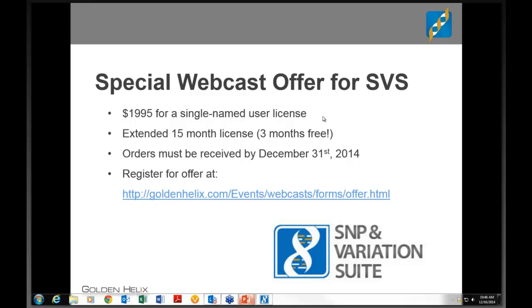Moving down, let's see, can exome data be used instead of SNP chip data for human near Mendelian disorders? That's an interesting question. It's a case that I haven't really tested. The question becomes, with exome data, typically a matter of the frequency of the SNPs and what kind of statistical power you get from them. Quite often, the SNPs on the exome chips tend to be very rare, very low frequency, and as a result may not be ideal for model building, but certainly there's nothing to stop you from doing it if you want to give it a try.